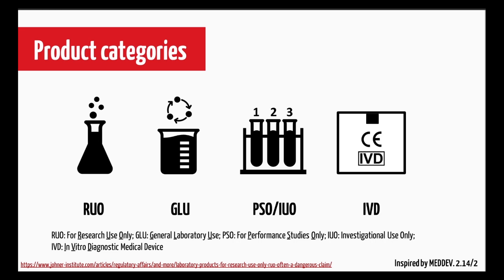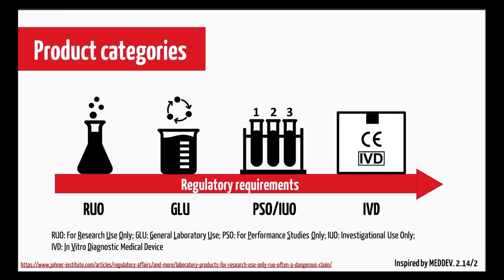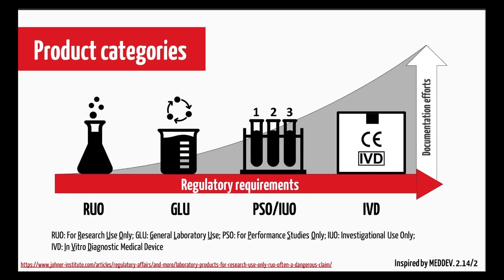This is then true for the CE IVD products. They have established analytical and clinical characteristics. The regulatory requirements are increasing from left to right, and also the documentation efforts.